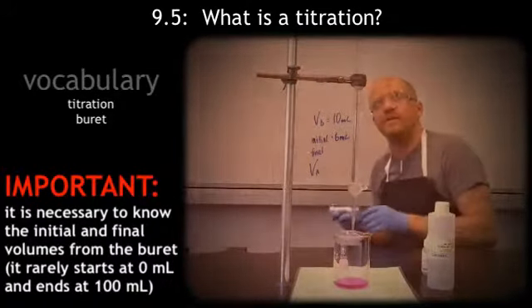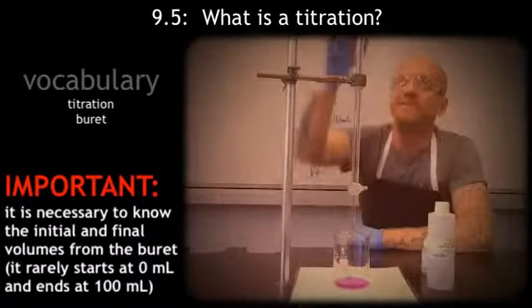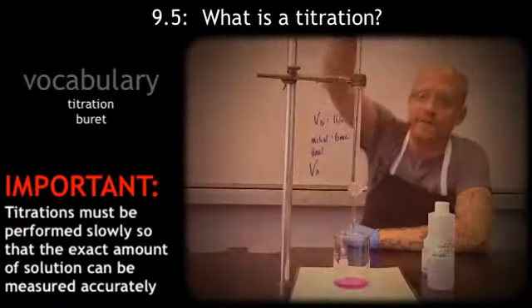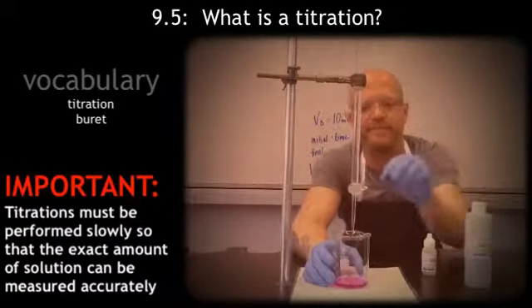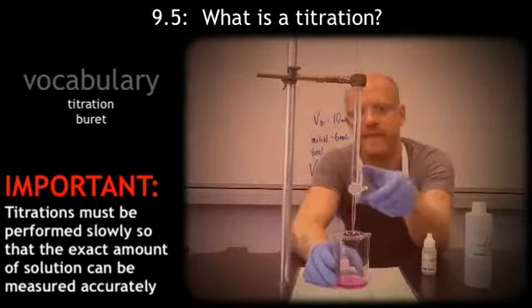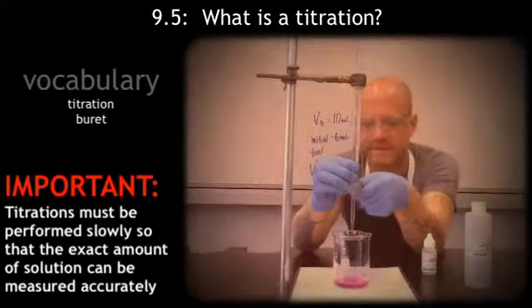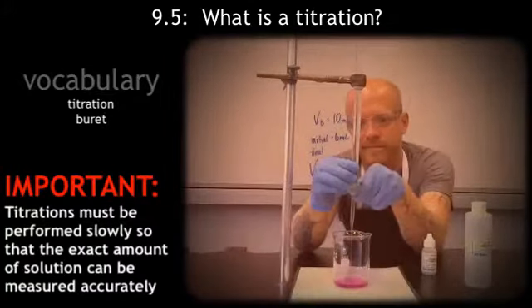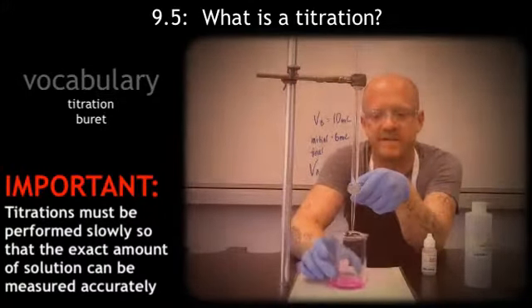Now I'm going to release this stopcock, and I'm going to slowly release some vinegar in here, and I'm going to swirl this around until it becomes clear. I don't want to go too fast, because there's going to be a point when it's just going to suddenly change.